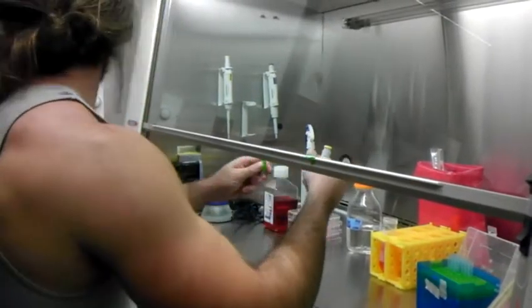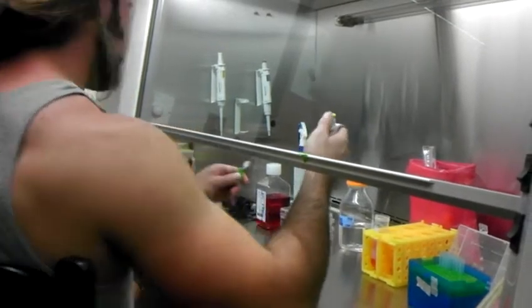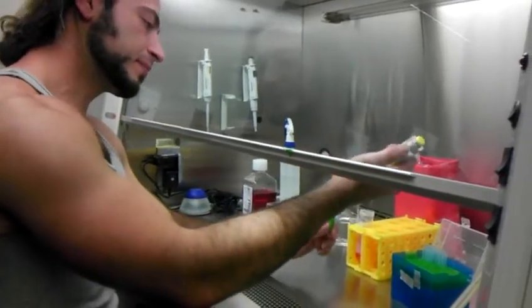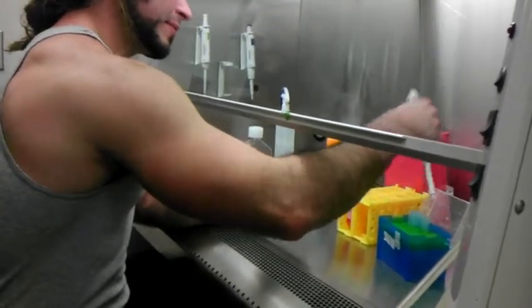What's this stuff called? Is there a name for it? Yes, reporter plasmid. Don't forget the tip. It's going to be a medium tip, okay? Don't want to forget the tip.